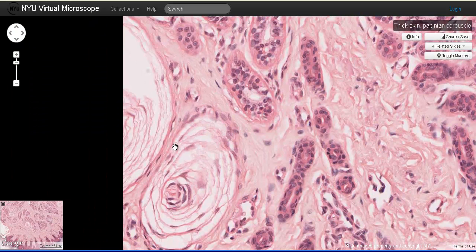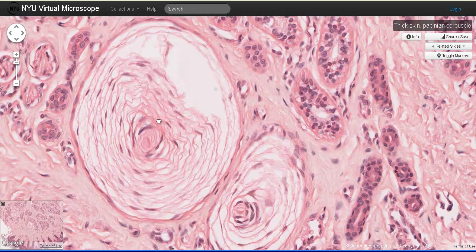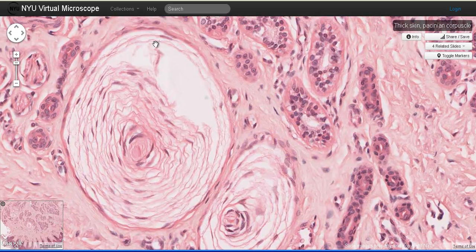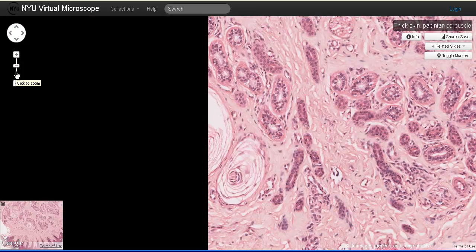Notice this rather large structure here — these structures are Pacinian corpuscles. Pacinian corpuscles are located deep in the dermis and we will also find them in the hypodermis. They respond to vibratory types of pressures and are responsible for our sense of deep touch. They are commonly referred to as pressure receptors. Notice how large they are.